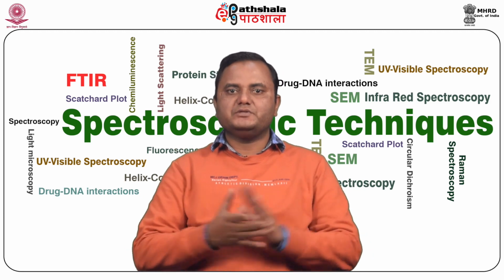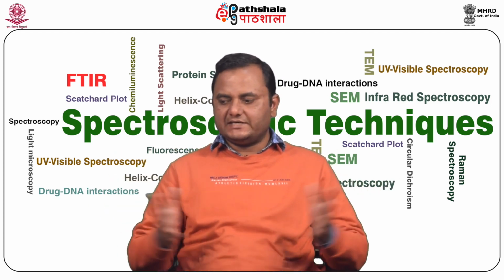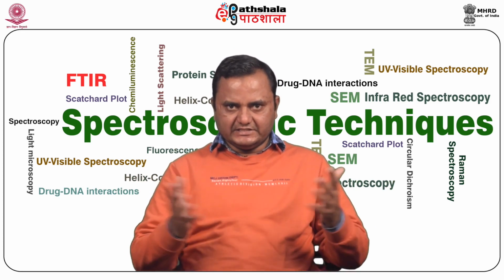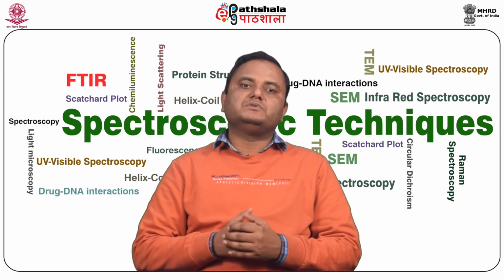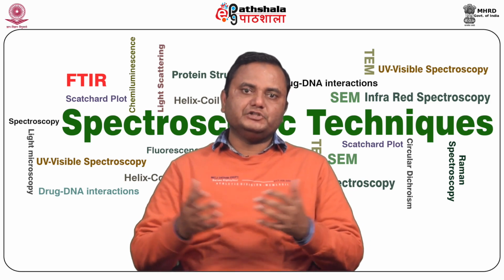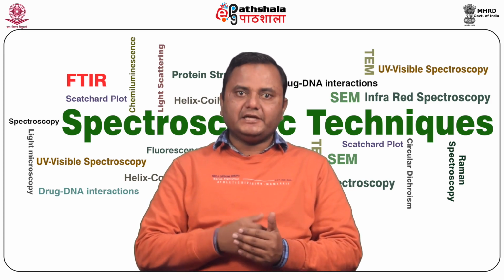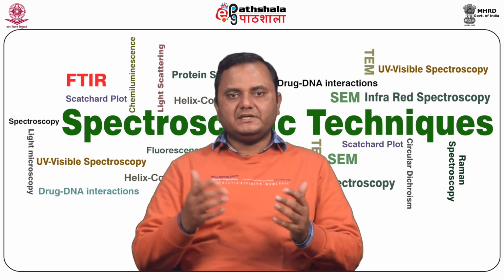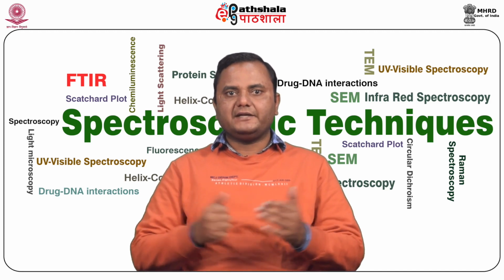It is most widely used for proteins and peptides to estimate the amount of secondary structure present. For estimation of secondary structure, CD is the most widely used technique, and it is also used to evaluate conformational changes that occur in a protein under different conditions or changes in the molecular environment. It also measures ligand binding phenomena, with the possibility to carry out both equilibrium and kinetic experiments.